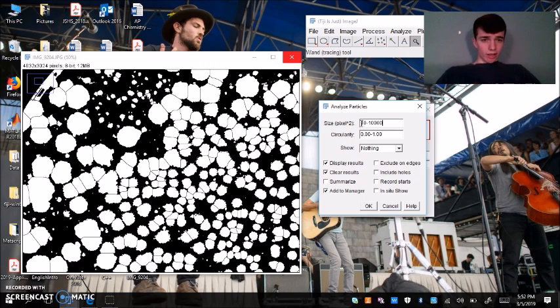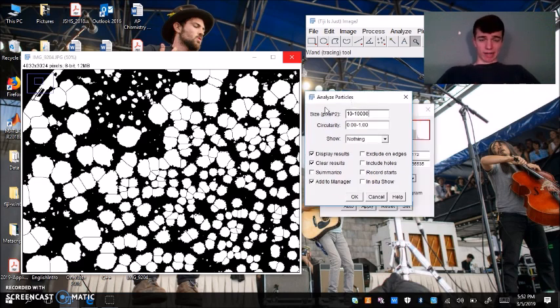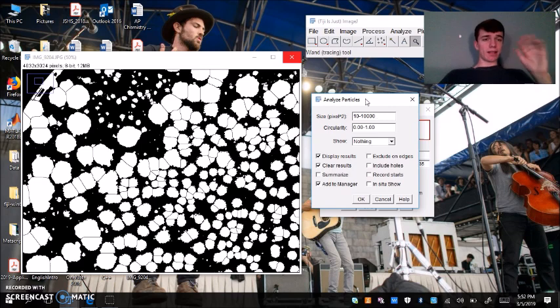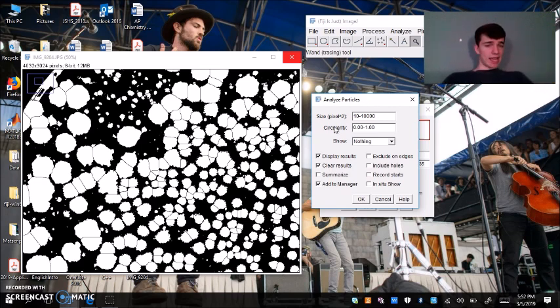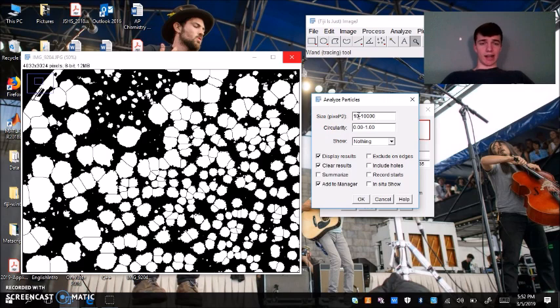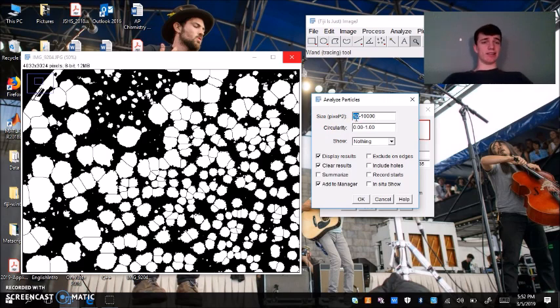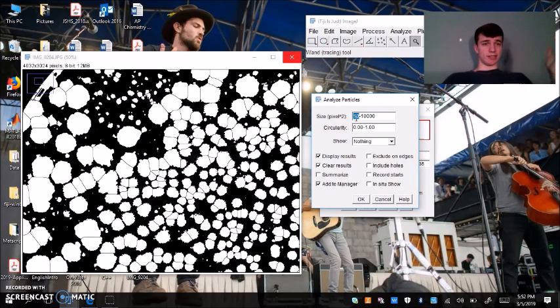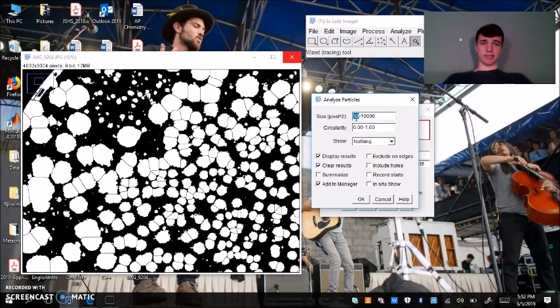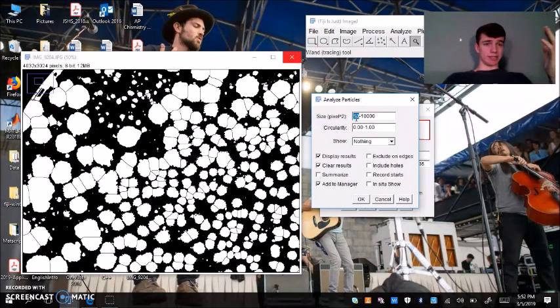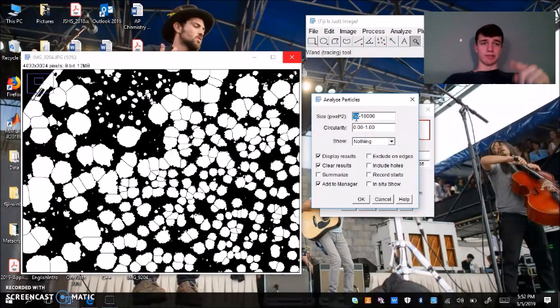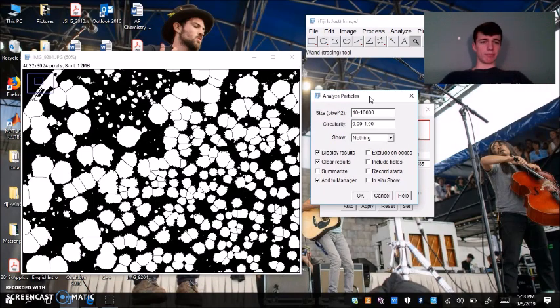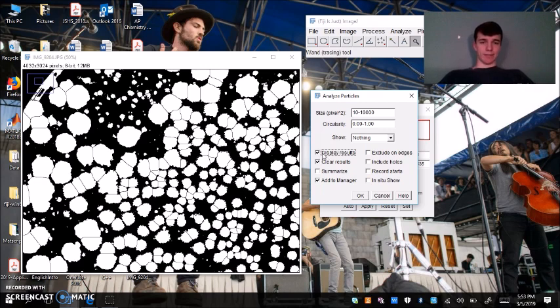Our first parameter is size in pixels squared. That allows us to exclude colonies of a certain size. The second parameter is circularity. Here I have only count colonies that are size 10 pixels squared to 10,000 pixels squared. But you can adjust this based on how big your colonies are and how big your picture is. It's different for everyone and you should definitely play around with this parameter.